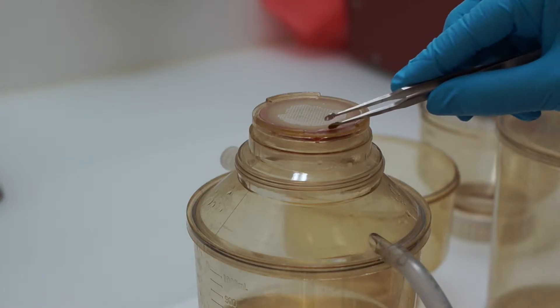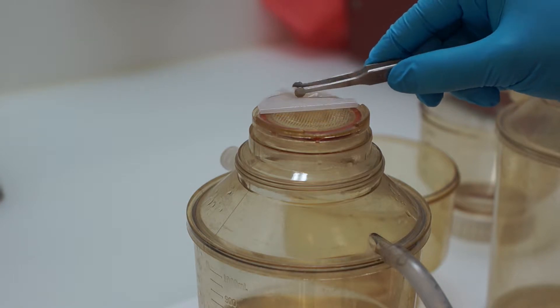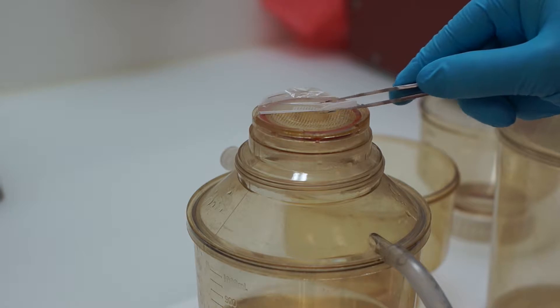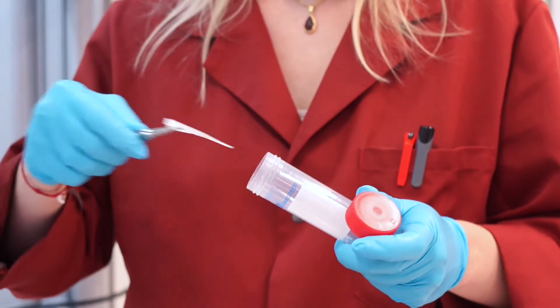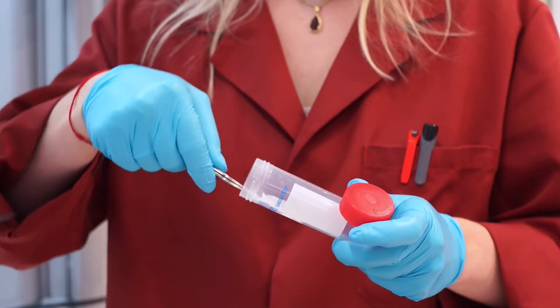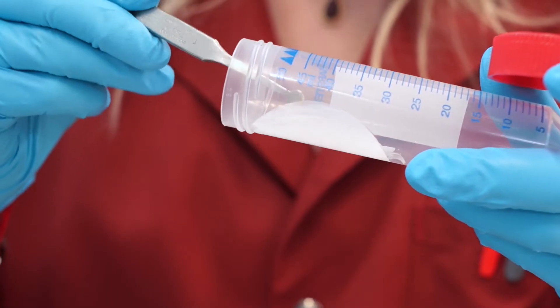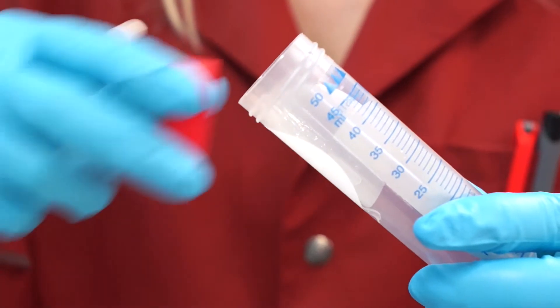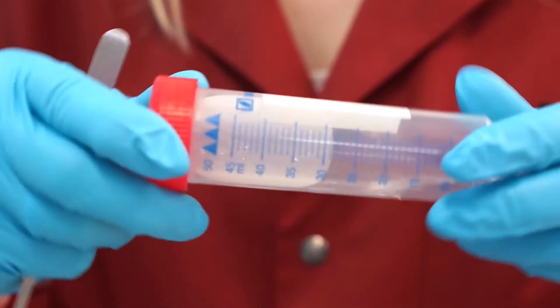With tweezers I'm folding the filter so that one margin is overlapping the other. I remove it from the filtration unit and place it into a 50 ml Falcon tube that I have prepared beforehand. I carefully unfold the filter so that the shiny side comes into contact with the buffer.